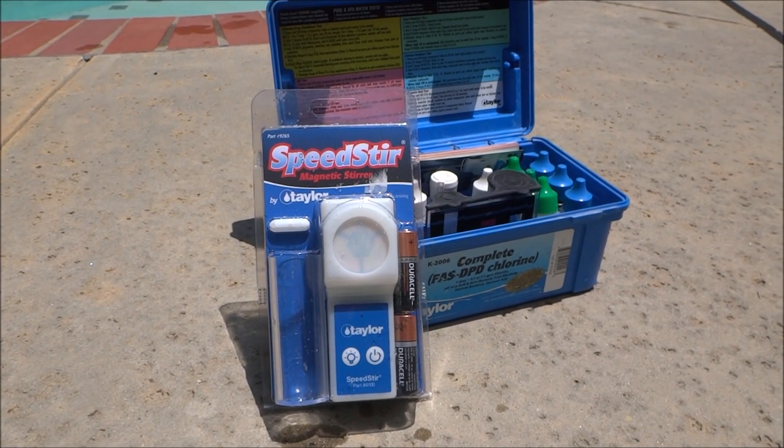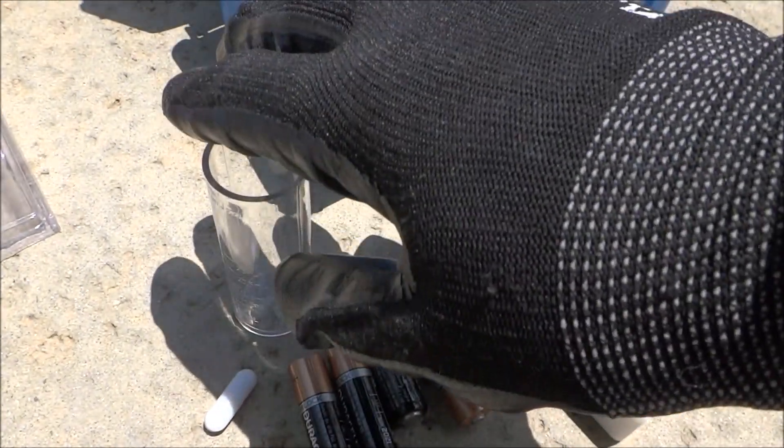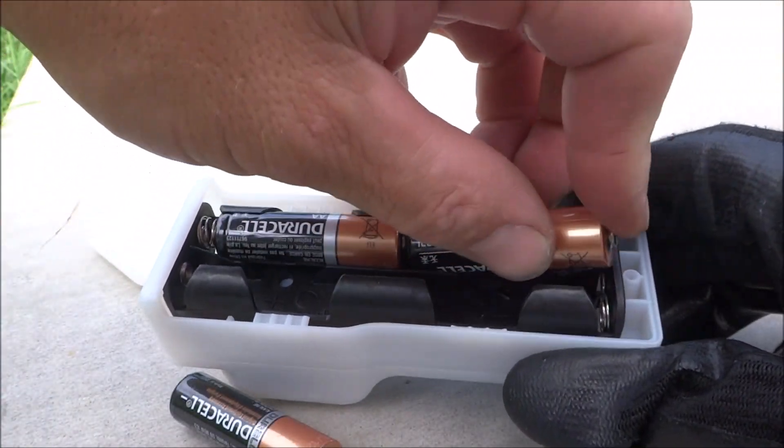In this video I'm going to show you the Taylor Speedster Magnetic Stirrer. So you have the Speedster unit itself, you have the test tube, you have the weight, you have the batteries for it. And the battery is sliding in very easily.